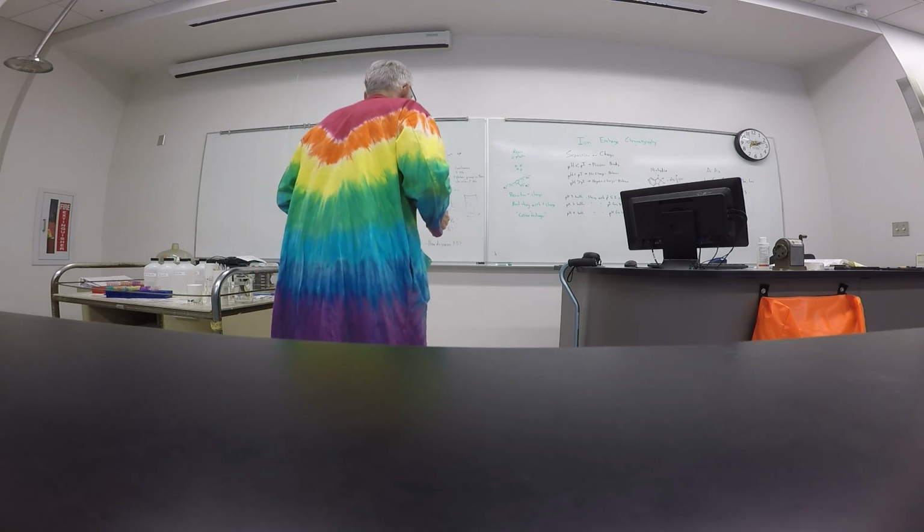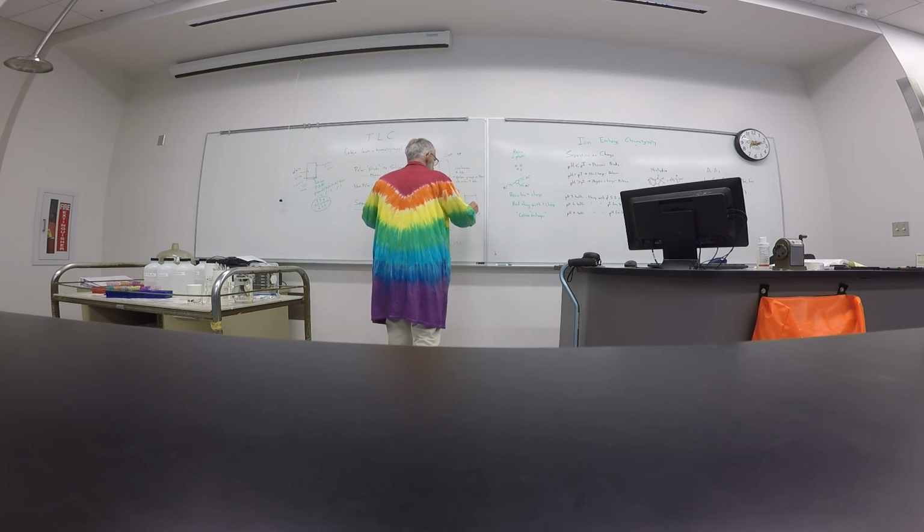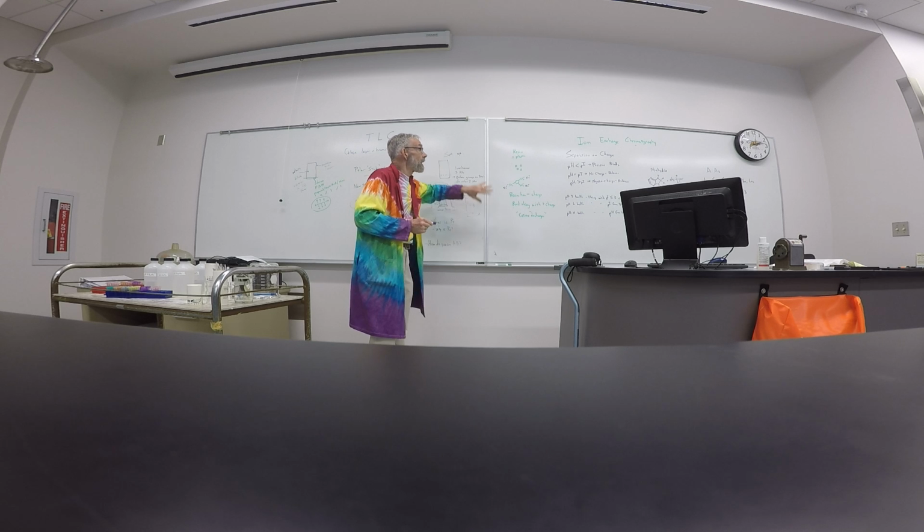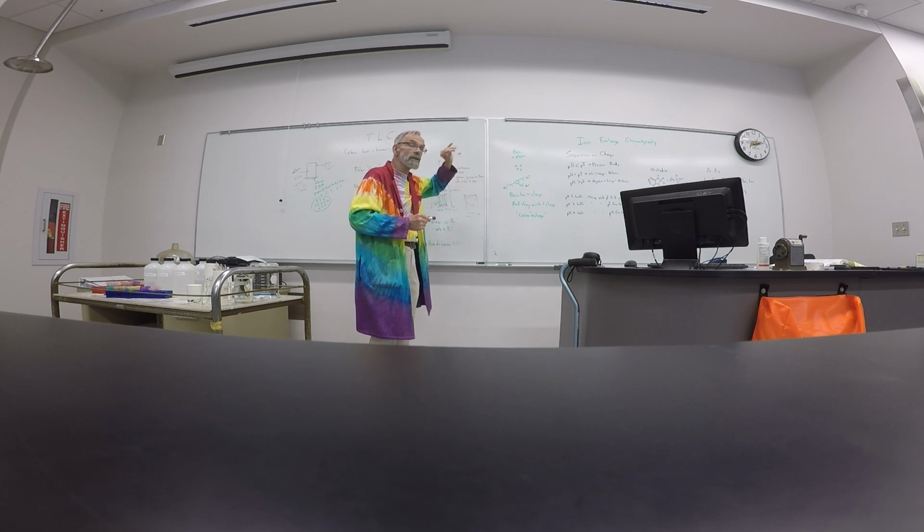And then you'll have your unknown that'll probably have all sorts of interesting stuff going on. Okay, I think we've covered that guy. Now, ion exchange chromatography. Now, this is one you didn't do in organic. We'll talk about it more later, as I said.